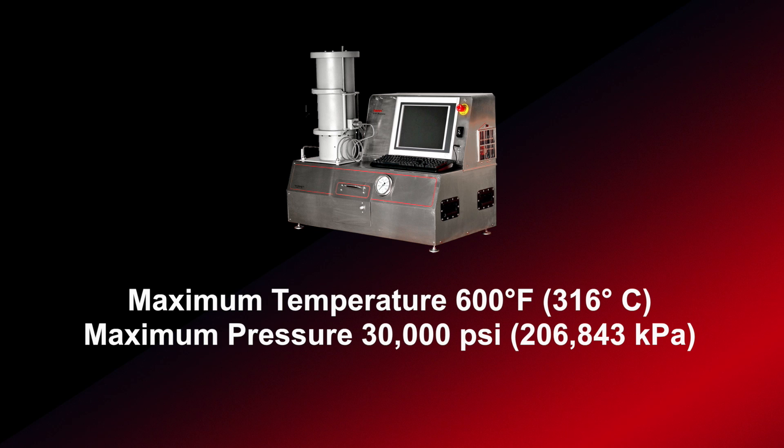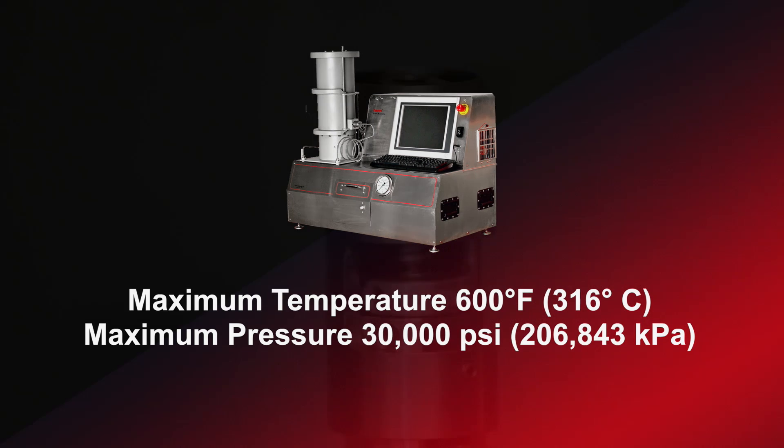Samples can be tested at temperatures up to 600 degrees Fahrenheit and pressures up to 30,000 PSI.